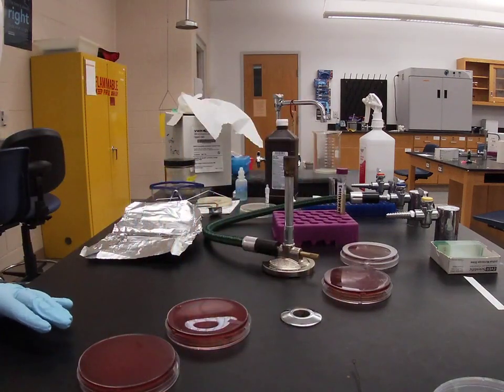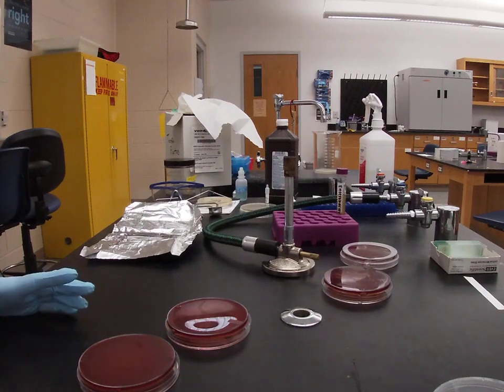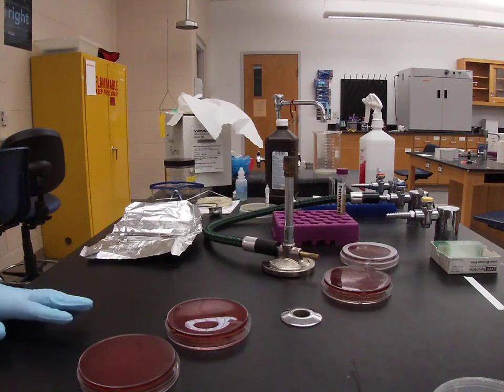Blood agar is only differential. It's not selective at all. Any bacteria can grow on blood agar, but the way that they grow on blood agar tells you something about the bacteria. Specifically, it tells you if they are able to lyse red blood cells, something called hemolysis. There are 3 different types of hemolysis: alpha hemolysis, beta hemolysis, and gamma hemolysis.